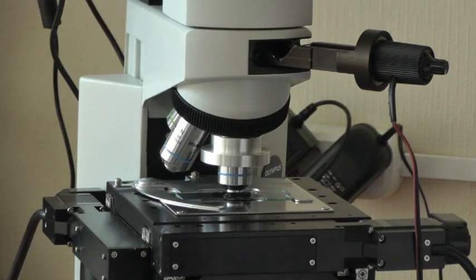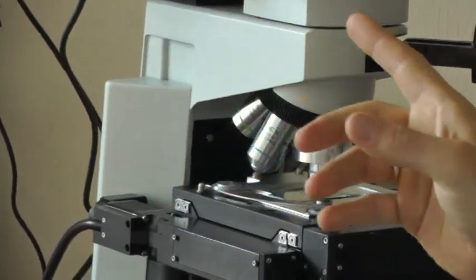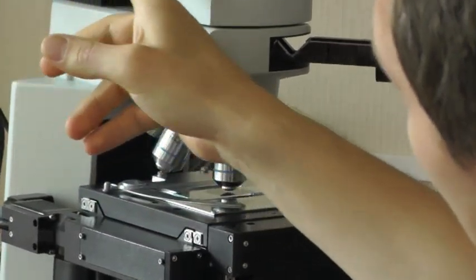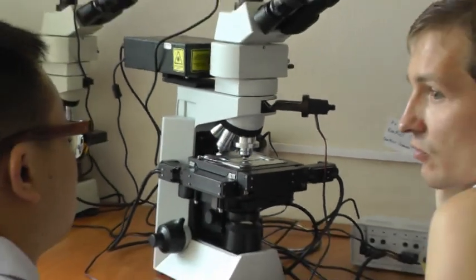The only thing we change is the adapter joining our Raman module with the optical branch of the microscope.